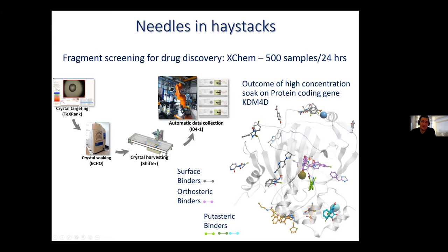The crystals are then soaked in many different trial solutions, hundreds and hundreds, laid out automatically in a big version of that well plate that I showed you. So you have many crystallization dishes, as it were. And then these individual samples are harvested, perhaps hundreds of them, and then they individually have their crystal structure measured. And the cartoon here actually is the large biological molecule with a map of where all of these library molecules, which might one day find their way as a component of a drug, bind on the crystal structure. So this crystal screening process hugely accelerates the process of looking for potential drug binding components.